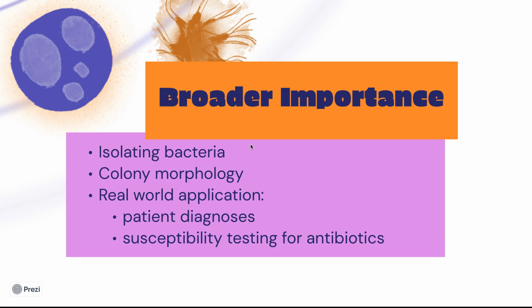So essentially, my results highlighted the unique colony morphology of different bacterial species. And as I said, this is very essential for identifying them in a laboratory setting, and can allow for technicians to analyze diverse patient samples to diagnose infections.